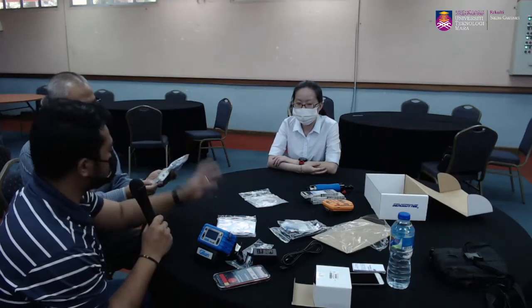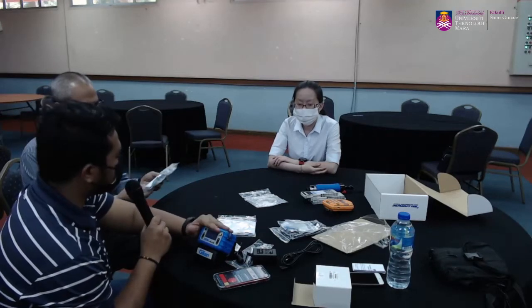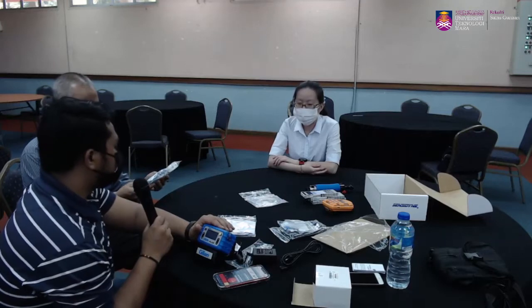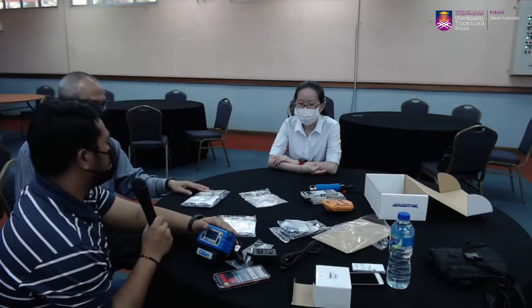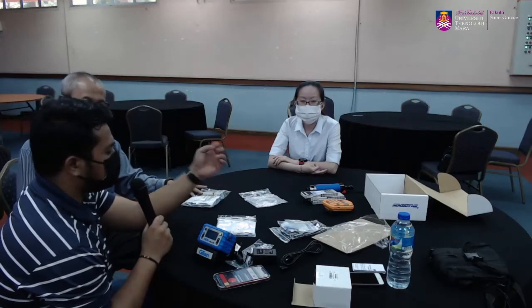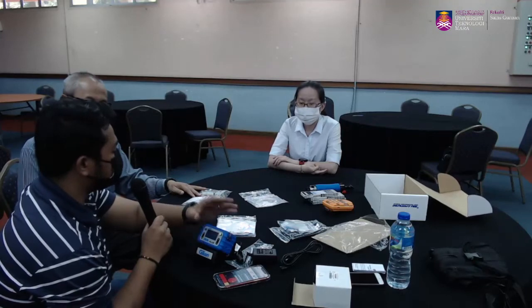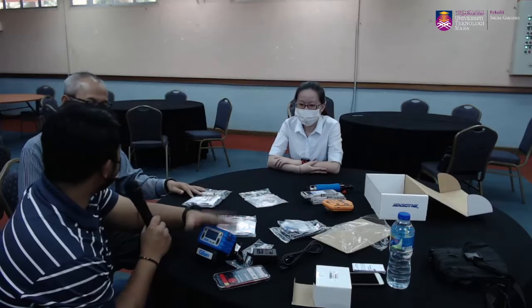So daripada situ is easy lah to identify, okay, pump ni memang daripada low flow sampai standard flow boleh up until 5,000 cc per minute, iaitu 5 liter per minute lah. So usually to standard flow punya samples kita boleh sampai lah. Sebab selalunya is the last one yang paling tinggi pun is 3,000 cc per minute. So ada yang boleh sampai 5 liter tu boleh pakai juga this pump.